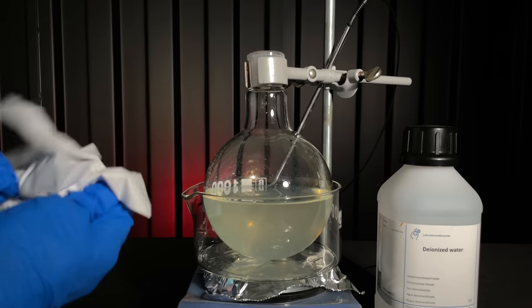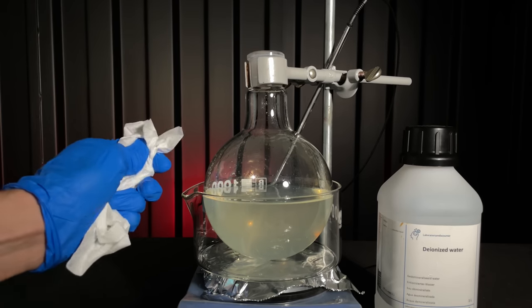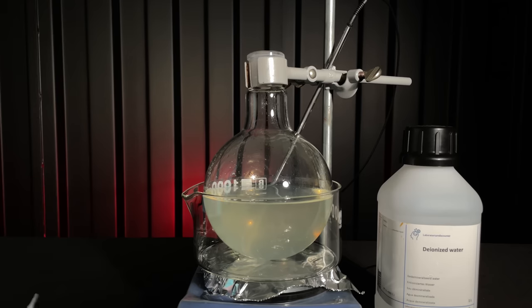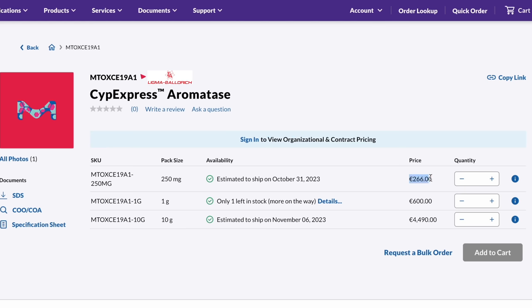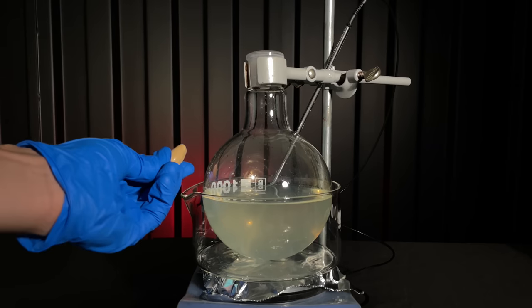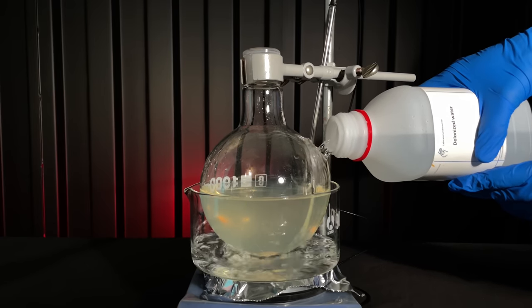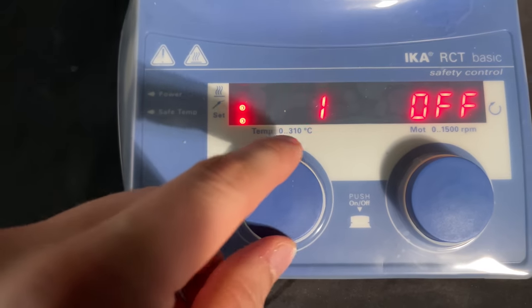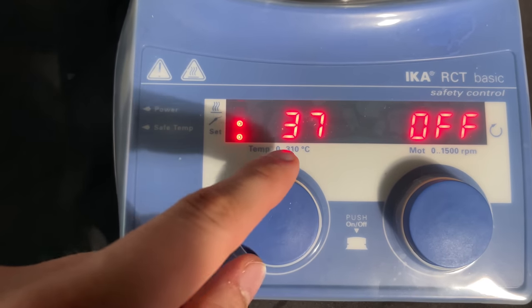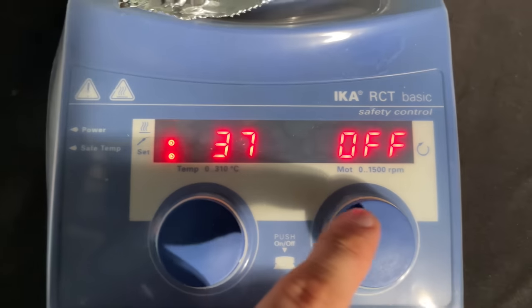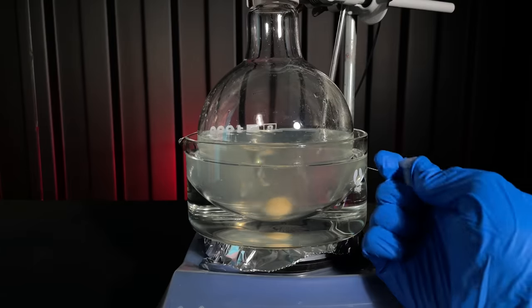Aromatase is also known as CYP19A1. Unlike normal chemicals, it is stored at dry-ass temperatures because it doesn't want to exist. Usually it is sold for a lot of money, but I was fortunate to know somebody who had it. Add a stir bar to your flask, set up a water bath, and you are ready for your first biosynthesis. Raw muscle powder goes in first and as you can see it does not dissolve well — the powder floats at the top, and for this reason plus the larger scale, the reaction will be stored for 48 hours. Fresh aromatase will be added in 8-hour intervals until the 250 mg are used up.